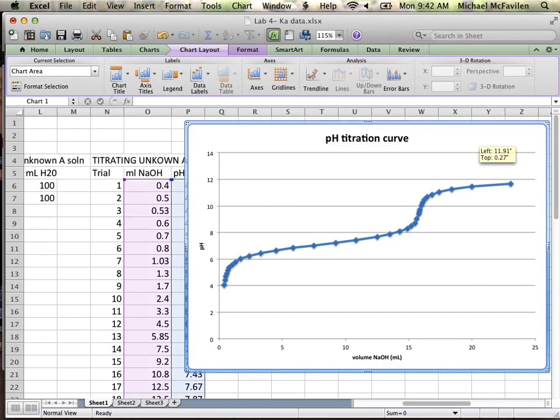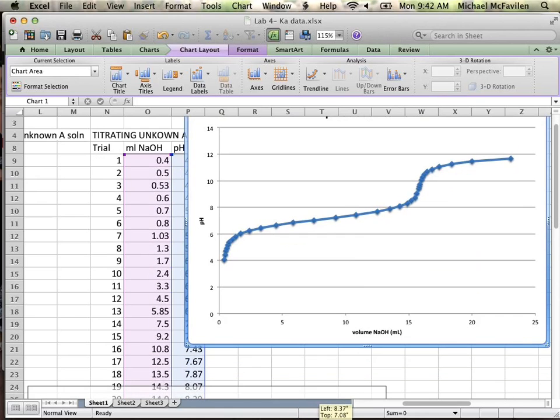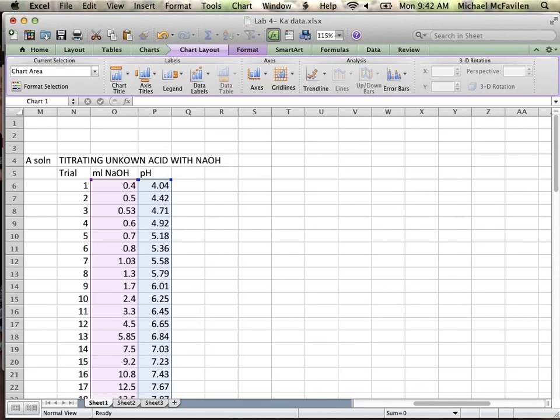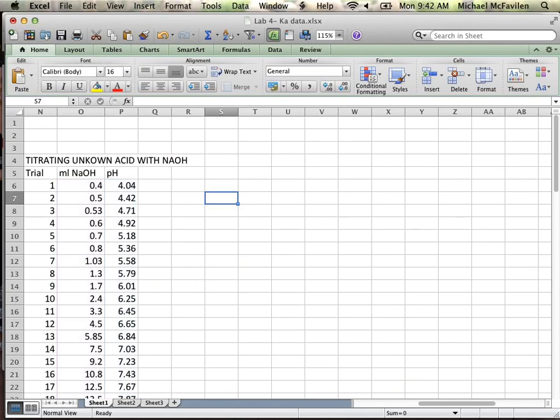And since we're now not going to interpret this anymore, sorry if this makes you dizzy, move that away. We now need a slope. Okay? How do we determine a slope? Rise over run, so the change in the y value over the change in the x. So what we're going to do is generate some new data. We'll call this our first derivative, okay, and this will be our new y value.